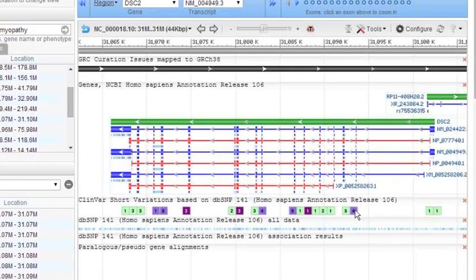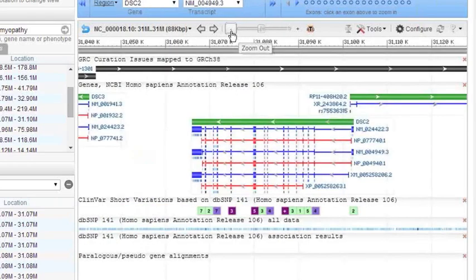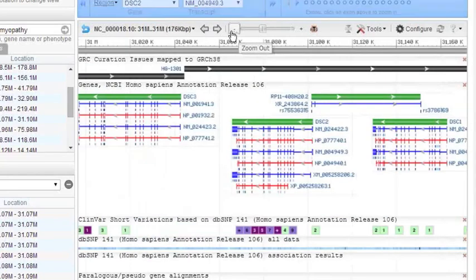And there are lots of ways we can do that. And I'm going to do it, first of all, by zooming out a little bit, just so you can see the kinds of genes that are around here. Okay, and you can pick up that little family of the desmocollins here. Here's desmocollin 1, 2, and 3. There is a transcribed gene above it that's a non-coding gene.